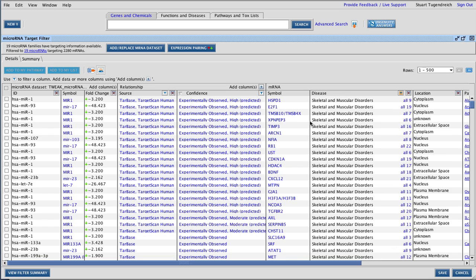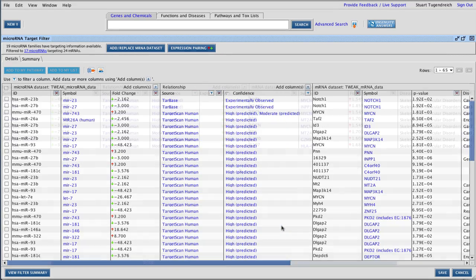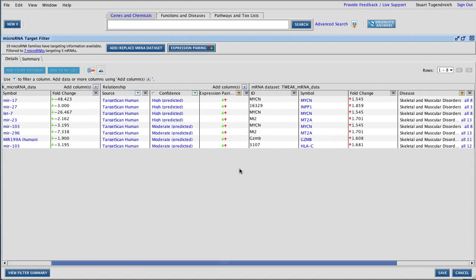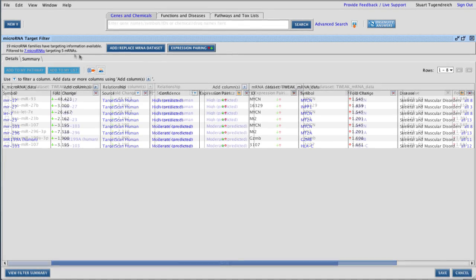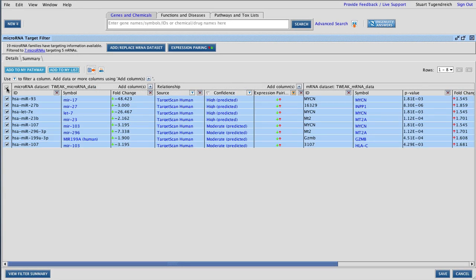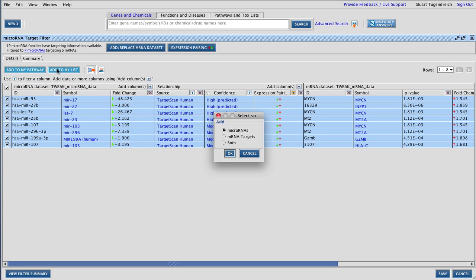I can add my own measured expression information about the mRNAs and use it as additional criteria for filtering. Here I have kept those microRNAs and mRNAs which show opposite direction of expression. The microRNAs are down-regulated and their targets are up-regulated. This reduces the search space down to just a few RNAs. This is a manageable set to test in the lab. If you wish, you can add these RNAs to a pathway and visualize the connections among them and color them by their expression levels.